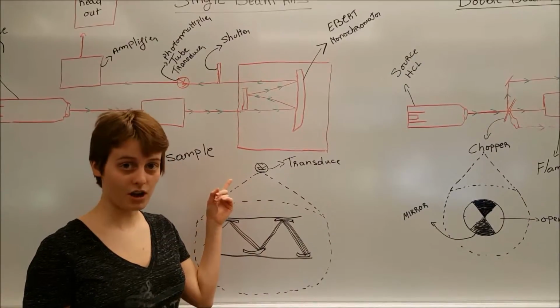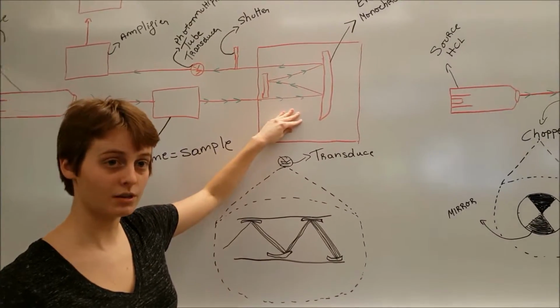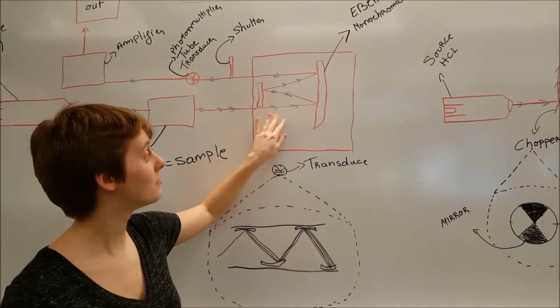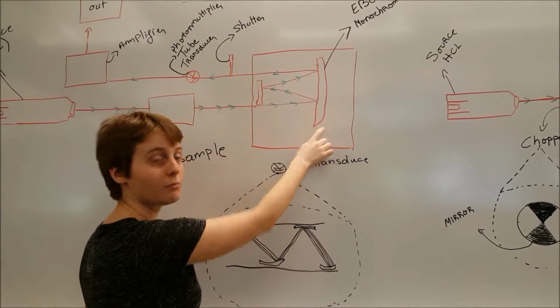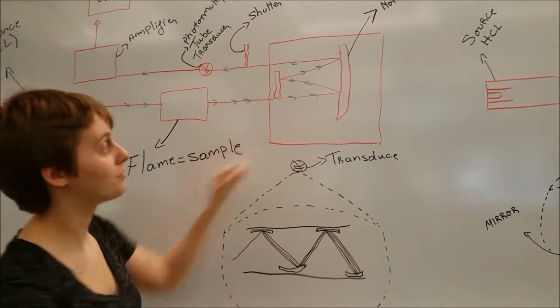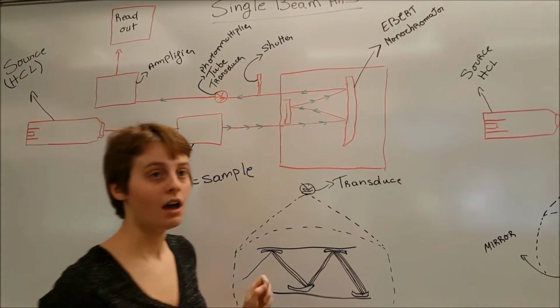This is Jean-Marc's drawing, which you saw earlier. This specifically right here is the monochromator, which is inside the instrument, which I can't show you. The monochromator is made up of one large spherical mirror, which will actually help focus the wavelength you want by separating out the specific wavelength so it passes through to the rest of the instrument.